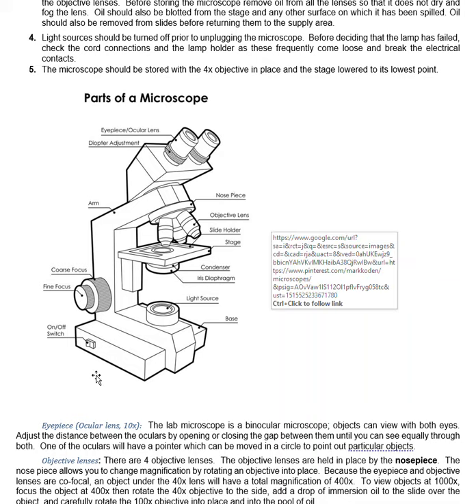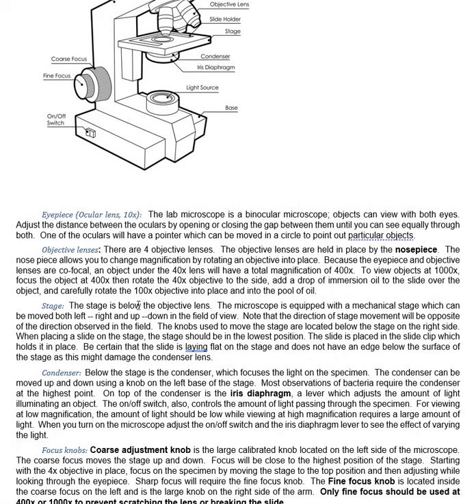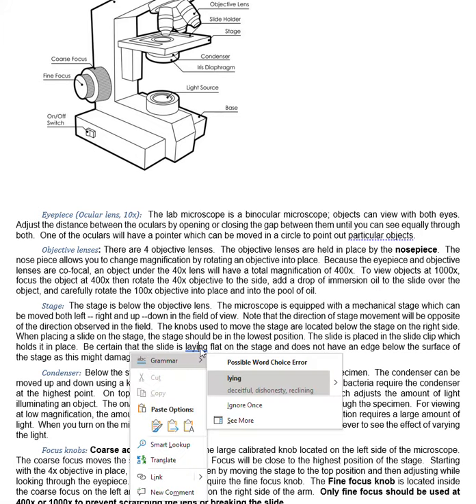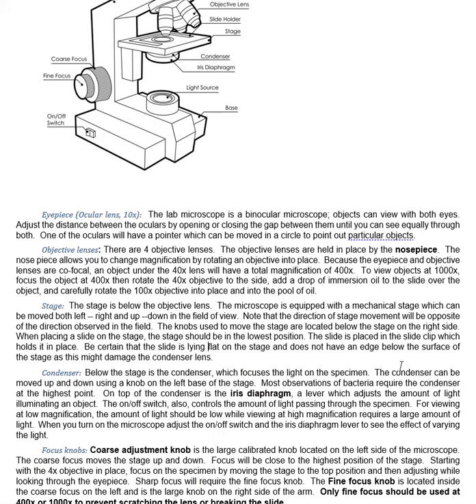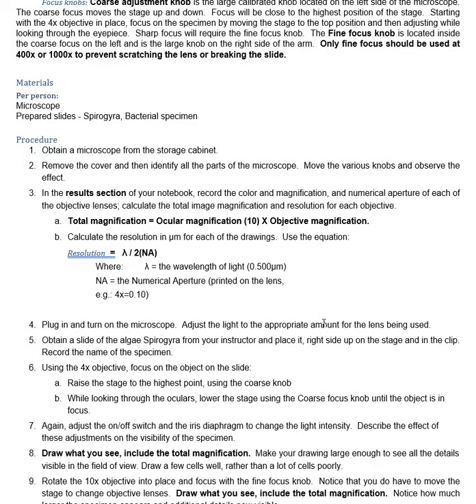The base of the instrument. Okay. I'm not going to read everything to you. I really don't think that's totally necessary, because I've told you most of what's going on here anyway. So if we were going to do this in the actual lab, we'll give you some pre-made slides of bacteria, and this is an algae. And you could put those on there and practice using the microscope. And then you would write down in your results section what's going on.